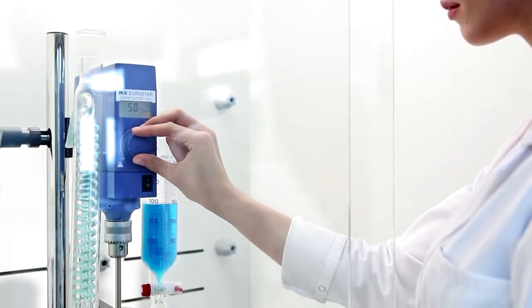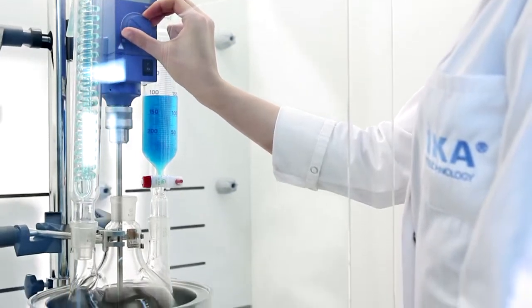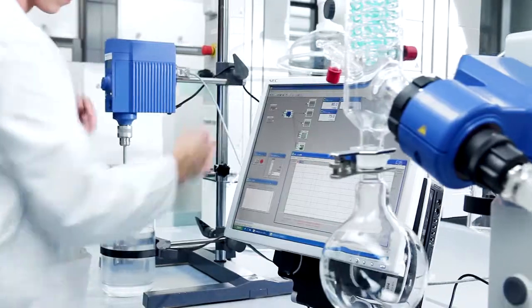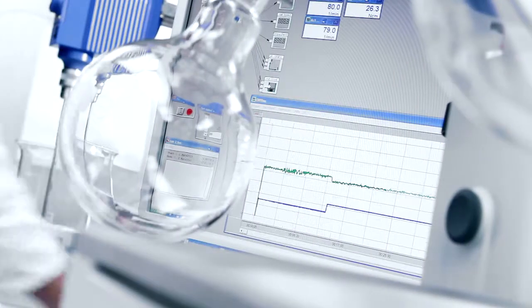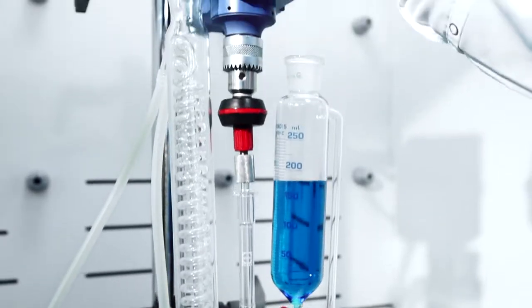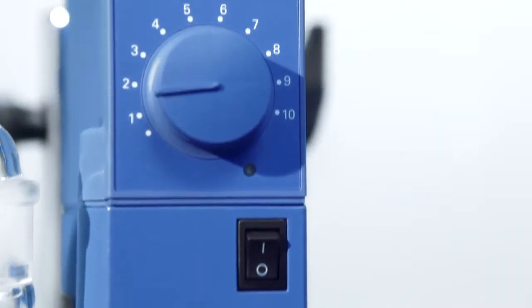Modern ergonomic design. Space saving and efficient. RS232 interface enables PC control ideal for monitoring and documentation with LabWorldsoft. All units are suitable to be operated for unlimited durations.